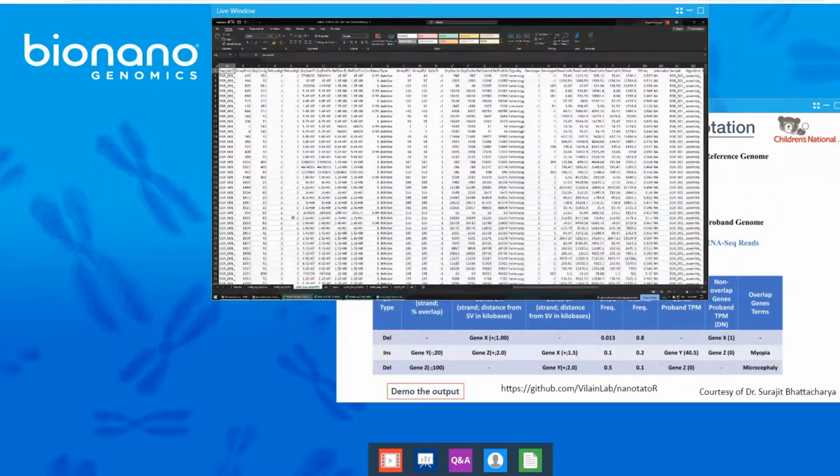For example, if two structural variations are within approximately 1 megabase of one another, then they will be identified and put in this category. Currently, what I want you to pay attention to is that none of these are filtered yet. So this is the raw output. And the next file I'll go over will have all the filtration. You'll see how powerful it is to decrease the number of variants that you need to look at manually.